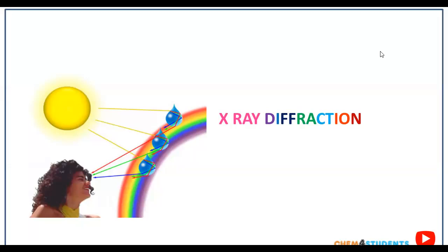If you want to be a crystallographer or crystal analyzer, you should be able to determine crystalline substances because 90% of the samples are in crystalline form. After completing this lesson, you will be able to understand how the X-ray diffraction technique is used to determine crystalline substances.